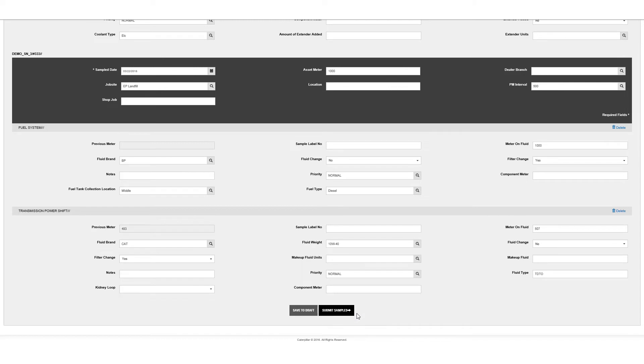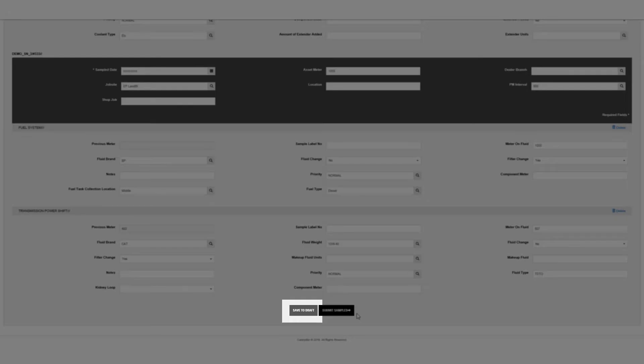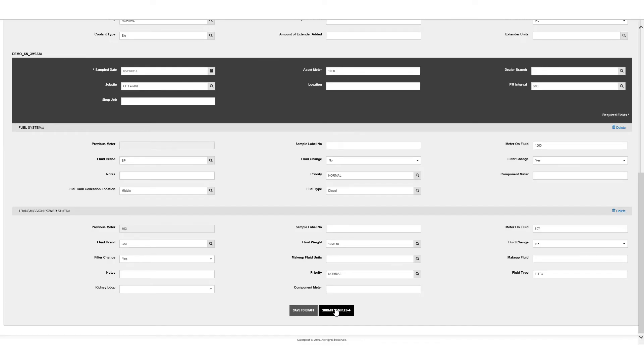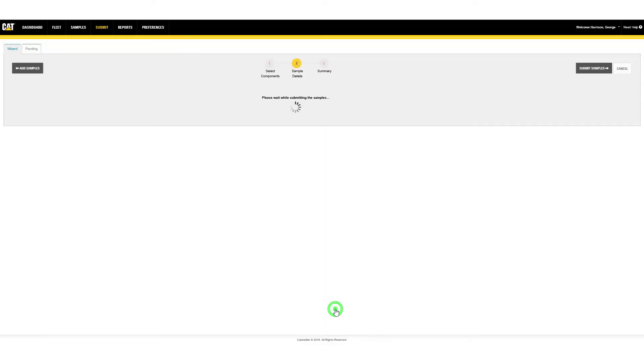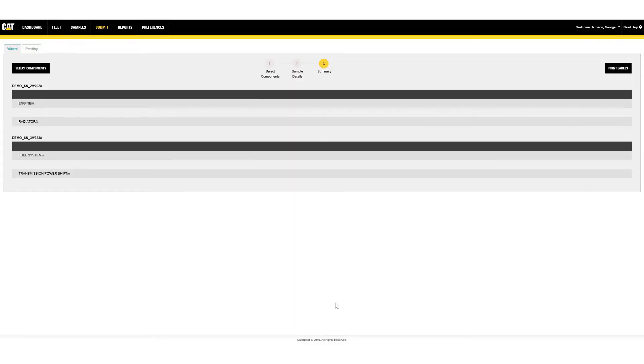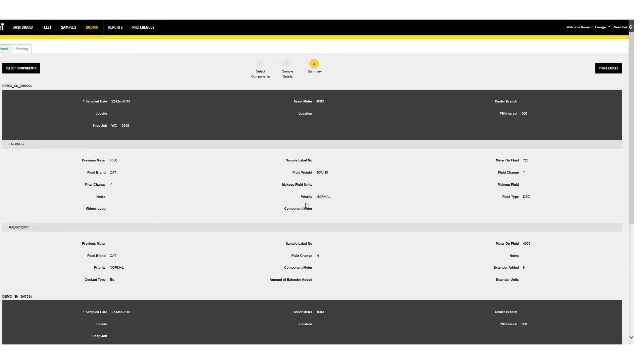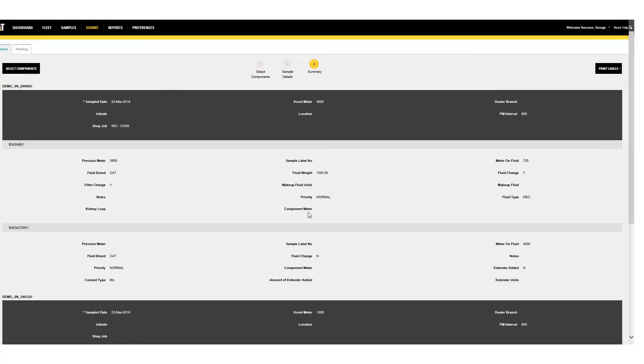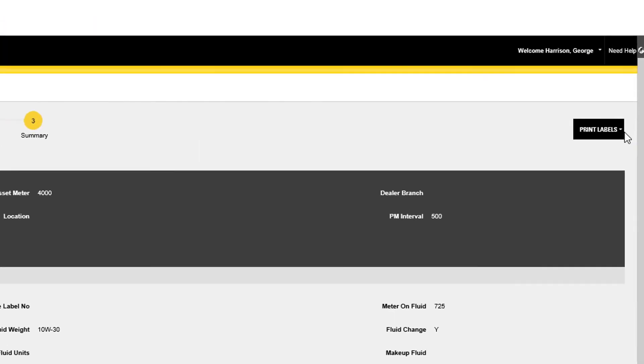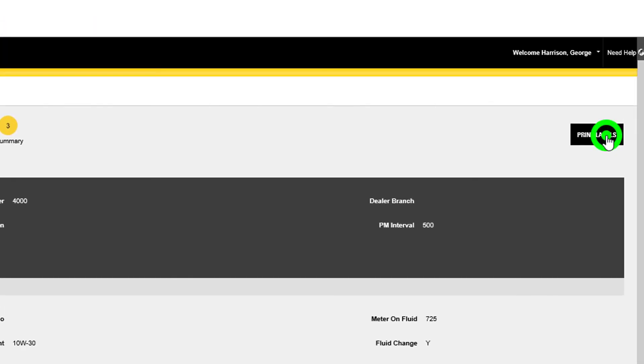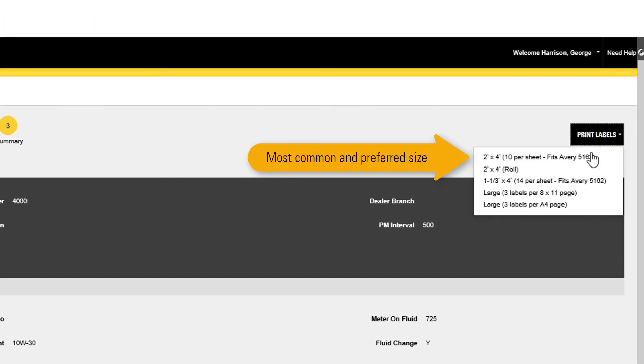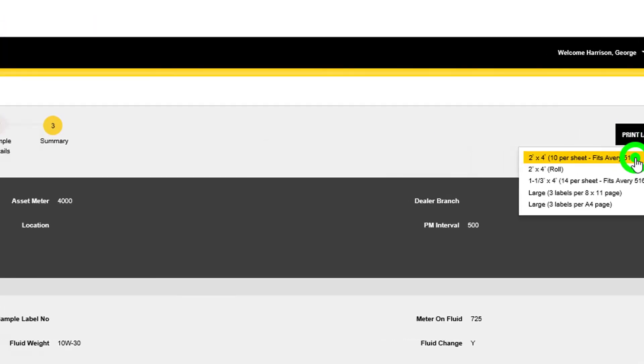At the bottom of the page, you'll have the option to save the information as a draft or submit for printing. Click on Submit Samples to be taken to a preview page. Verify the information and click Print Labels. Select the paper size that you prefer to use.